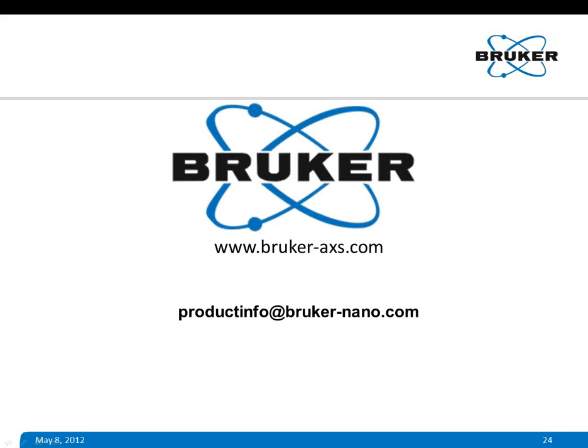This reference electrode tip is preserved by using a Luggin capillary, a capillary which is attached to the tip of the electrode, and it is filled with the same kind of solution which is used to make this particular reference electrode. Say for instance, for AgCl we use potassium chloride. So that Luggin capillary has to be filled with potassium chloride solution, and the whole thing is installed in the tribocorrosion cell, so that the capillary will prevent the contamination of the tip of the reference electrode.